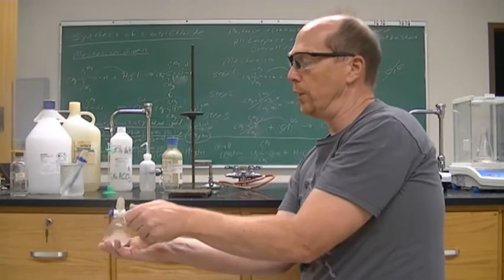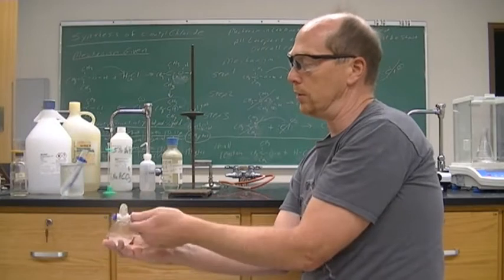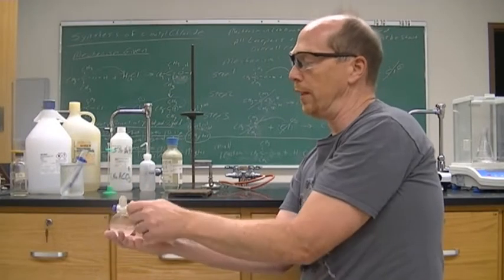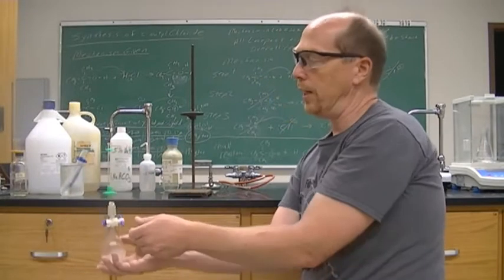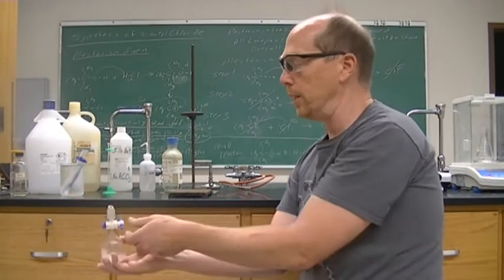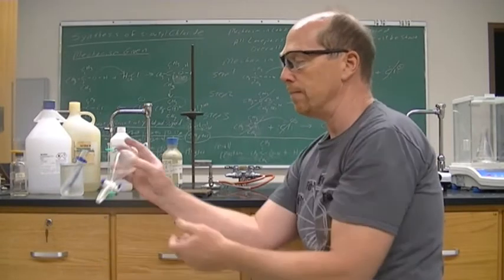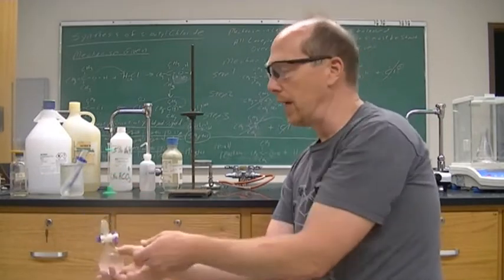And it says to react this for about 20 minutes. And we're going to get 2 layers, because what I didn't explain in our mechanism over there, is that our alcohol is OH, and that's very polar, it's got hydrogen bonding, and so it is going to be miscible, it's going to mix freely with our aqueous acid.